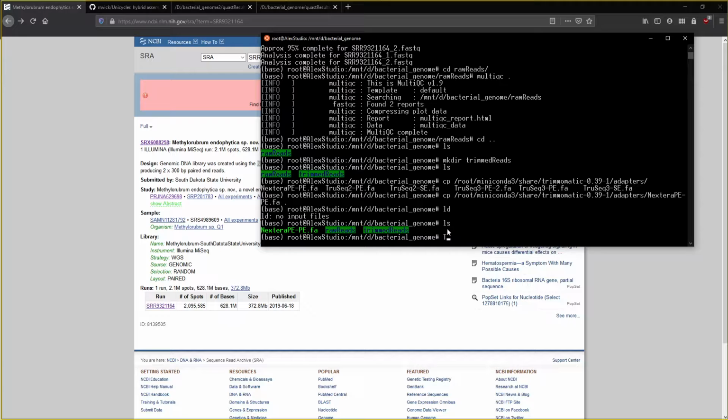Awesome. We can do Trimmomatic. We want paired end because we have paired end reads. Threads, it doesn't really matter. We'll do 8. Trimmomatic is really fast since this is a really small file. We'll feed in our reads files. So reads, SRR, we'll go _1 for forward. What is it not liking here?